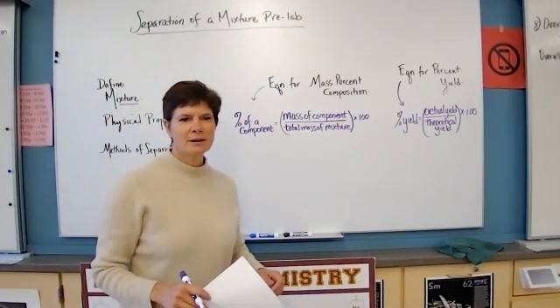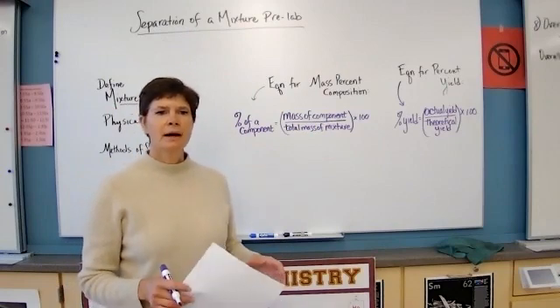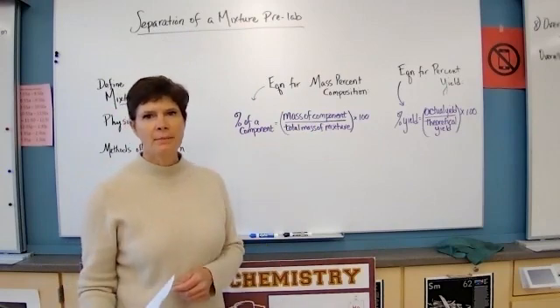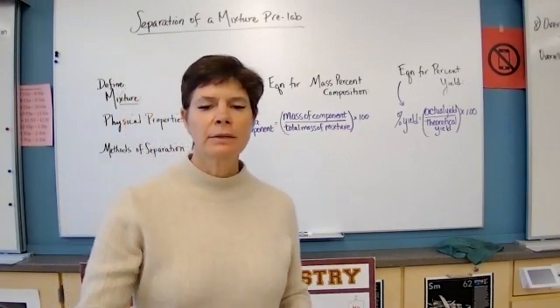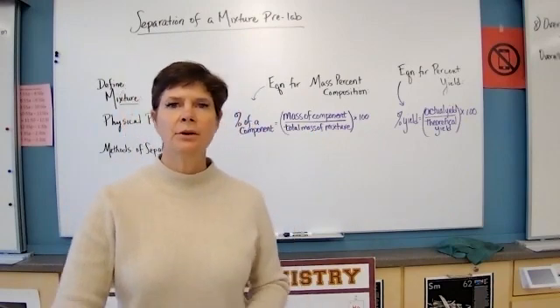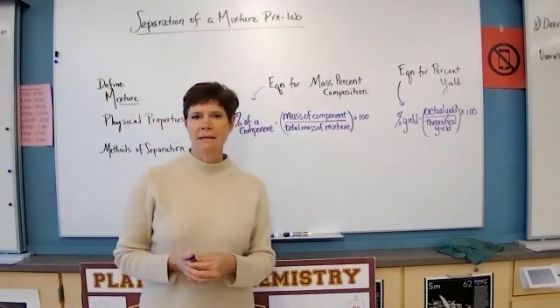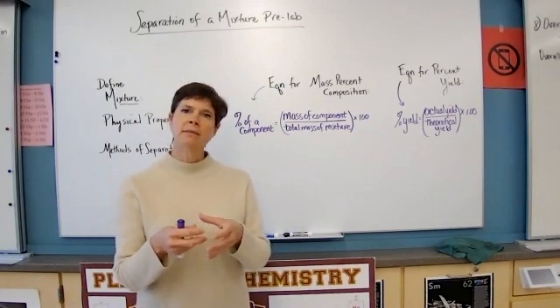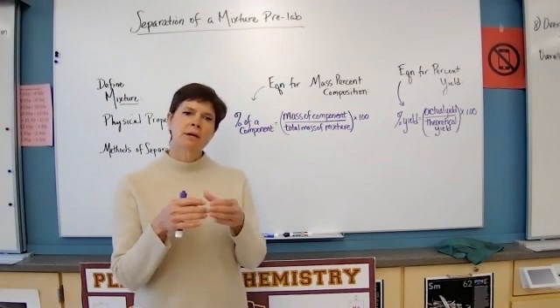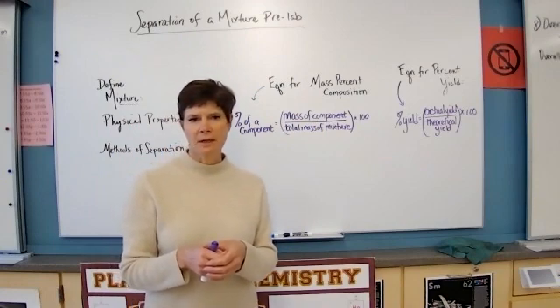Hi, this is Ms. Varka, and we're going to go through separation of a mixture pre-lab in order to prep you for the lab that you'll be doing this week. In the lab, you will be putting together a mixture of salt and sand and iron after getting the masses of each one of those, and then you'll mix them together and attempt to separate them using physical properties of the different components of that mixture.